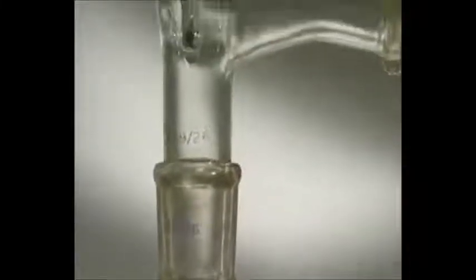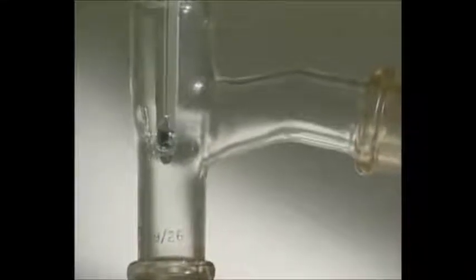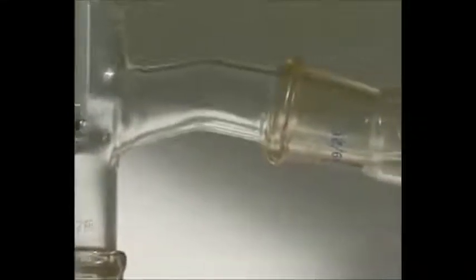It's a long way to go, and the further from the heat source, the cooler it gets. Most of the vapour condenses on the glass spiral inside the column and drips back into the mixture. Only the hydrocarbons, which are still vapours at the very top of the column, enter the sidearm and condense to liquid.